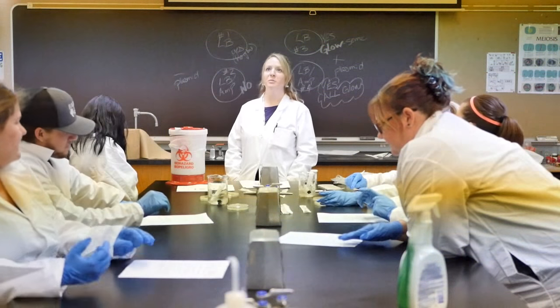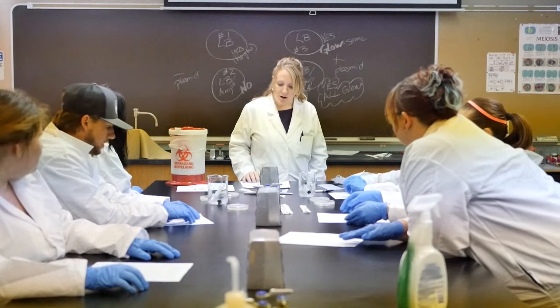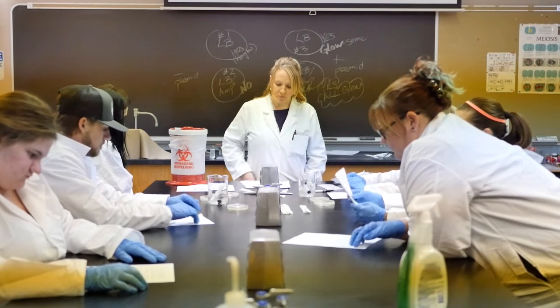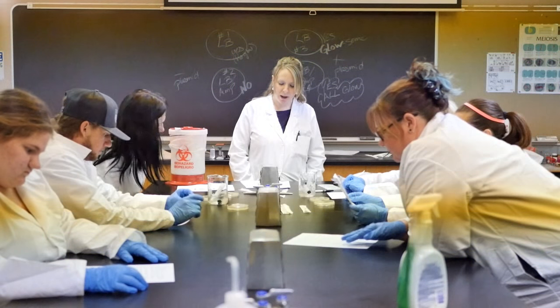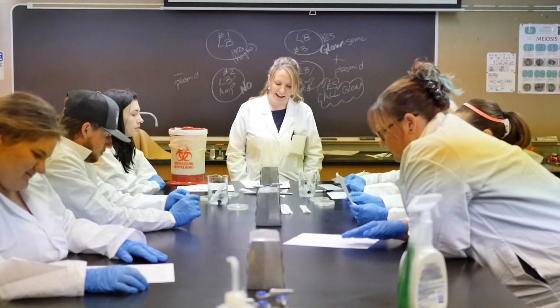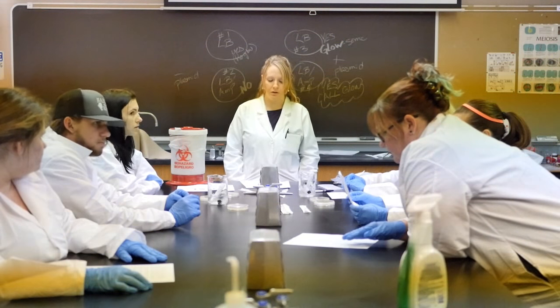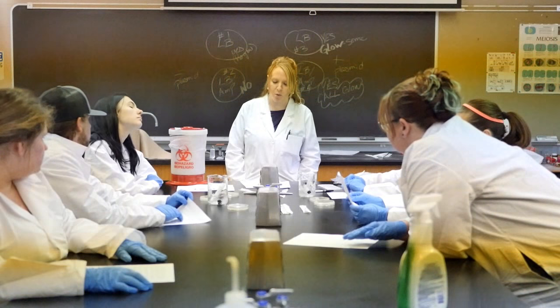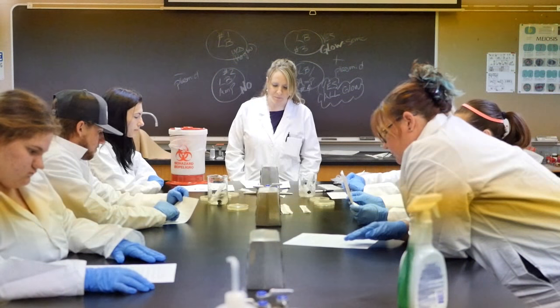All right, we've got 2 minutes for this little thing to recover. So let's talk about the next couple steps. After this is done recovering in its little ice bath from the awful heat shock, we're going to give it some nutrients and encourage growth again. The nutrients are found in the Luria broth vials in your little ice water baths.